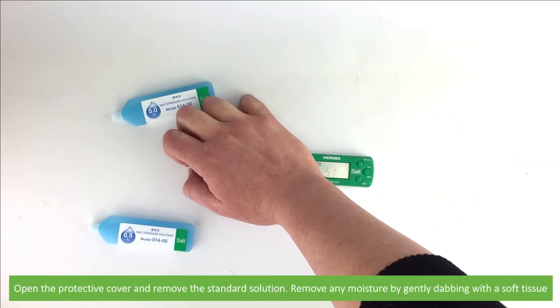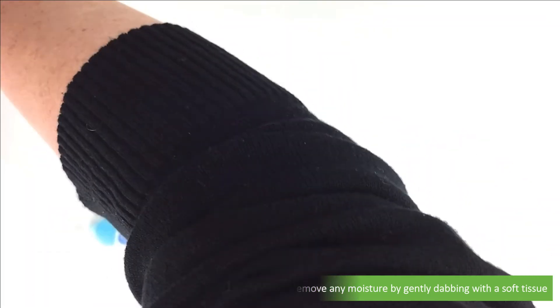Open the protective cover and remove the standard solution. Remove any moisture by gently dabbing with a soft tissue.